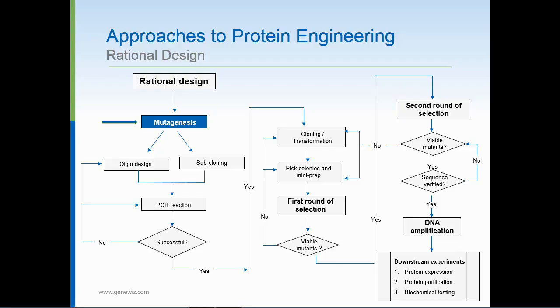This step creates a clone consisting of a section of the gene of interest that corresponds to the desired protein region of interest that requires further manipulation. This now serves as the template for the mutagenesis step, and it substantially reduces the risk of incorporating unwanted mutations if a larger region of interest was used in the PCR reaction.